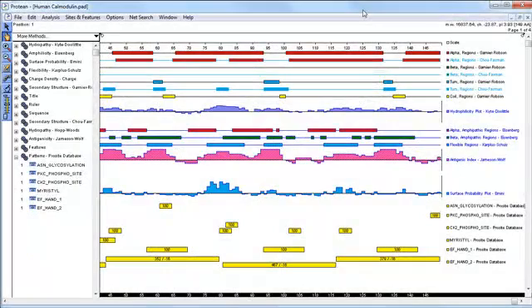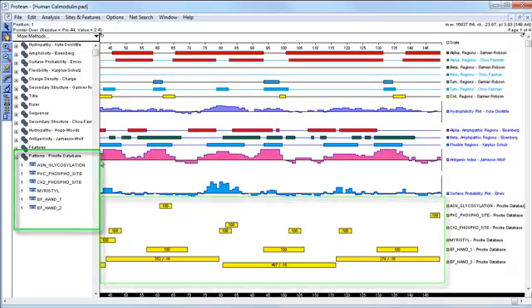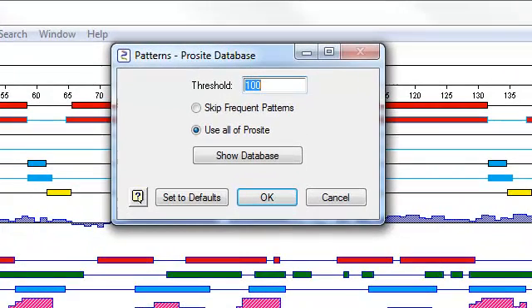You can edit the match stringency threshold used by the Prosite database by double-clicking on the method, either from the analysis surface or from the method curtain. That brings up the parameters dialog for the Prosite method. The default threshold value is 100%, but it can be lowered in order to find non-identical matches.